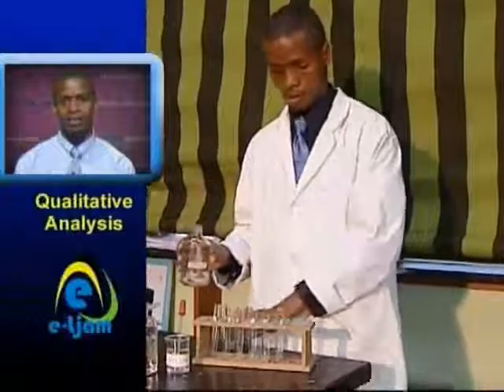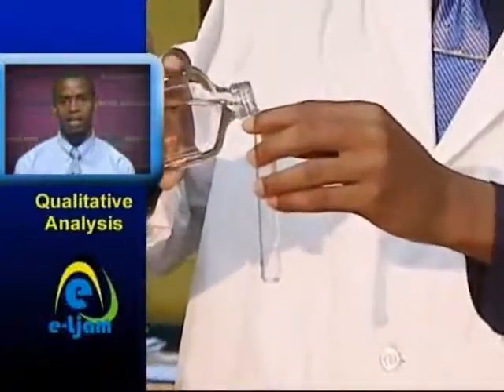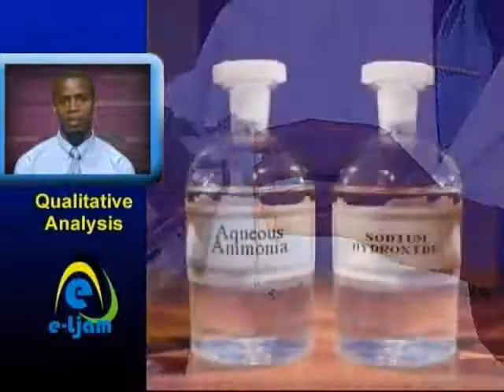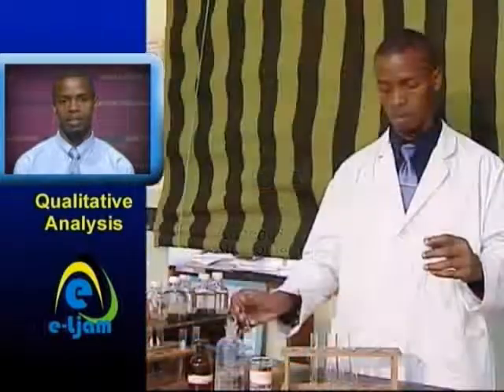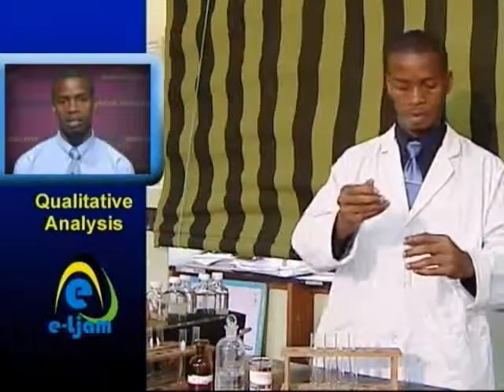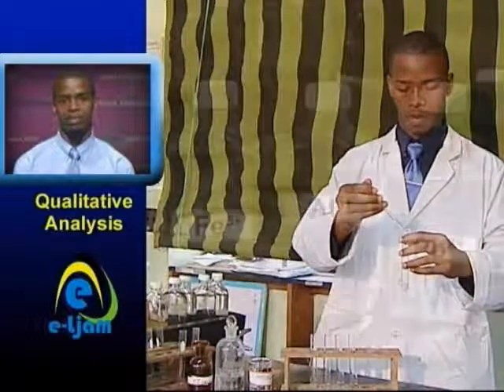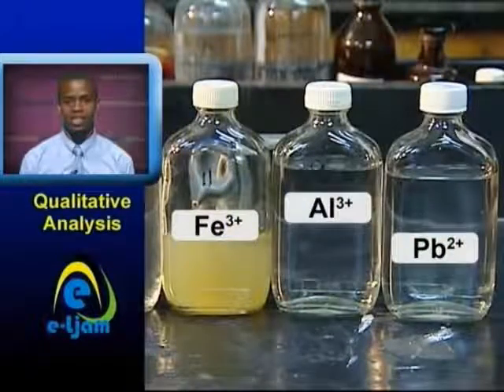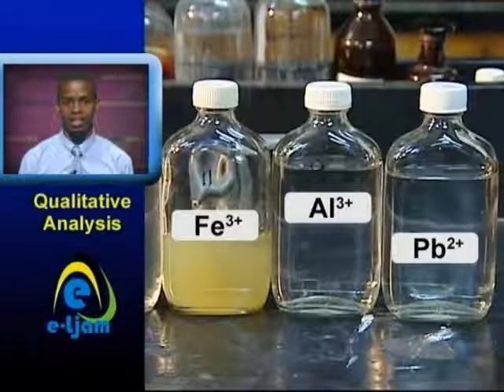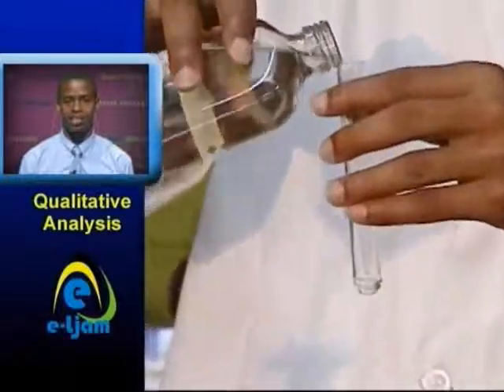The general method involves identifying metallic ions or cations based on the color and solubility of the hydroxide formed when they react with aqueous ammonia and aqueous sodium hydroxide. If this does not narrow down the unknown to a single cation, a confirmatory test will need to be done. The general method of analysis involves, firstly, preparing a solution of the solid under investigation. Next, place a sample of the solution in a test tube.